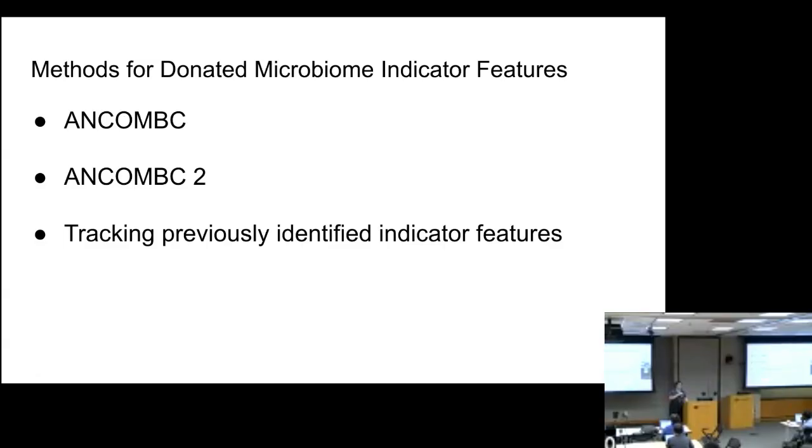So really quick, I'm going to show you using ANCOM-BC, comparing the donated microbiome to the baseline. We have to be really specific about using ANCOM-BC because we are violating statistical assumptions if we use repeated measures here. Looking at the donor and baseline, they are not dependent on each other yet. But if I used any other time point, I might have dependency issues. So I'm really specific here to look at donor to baseline.